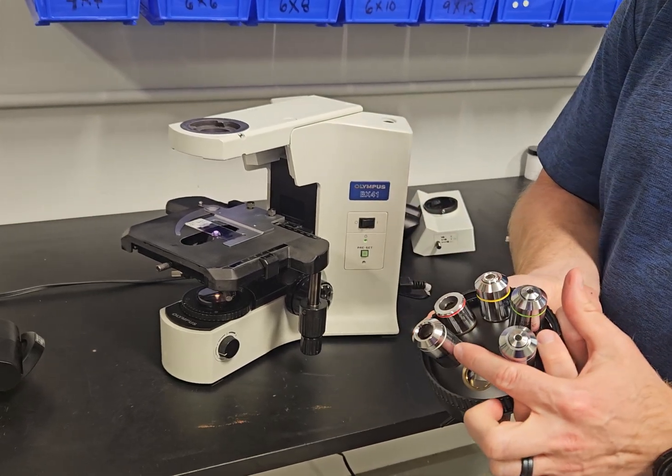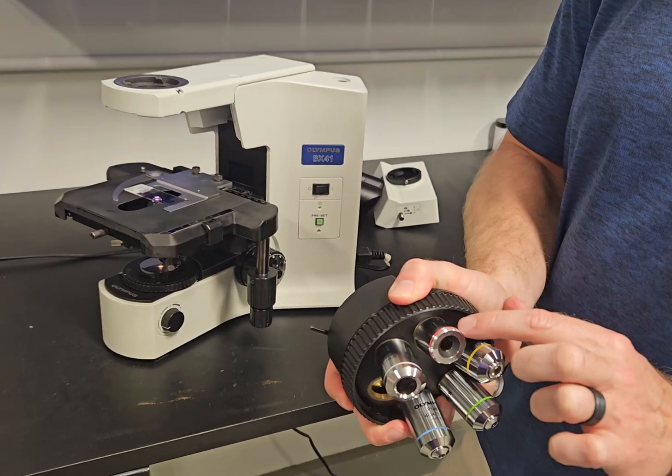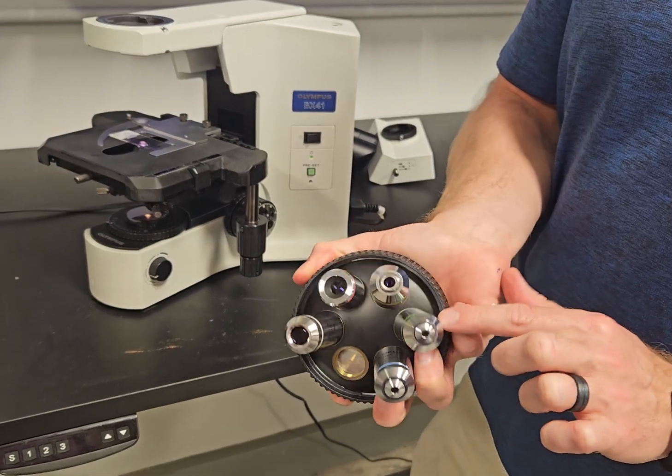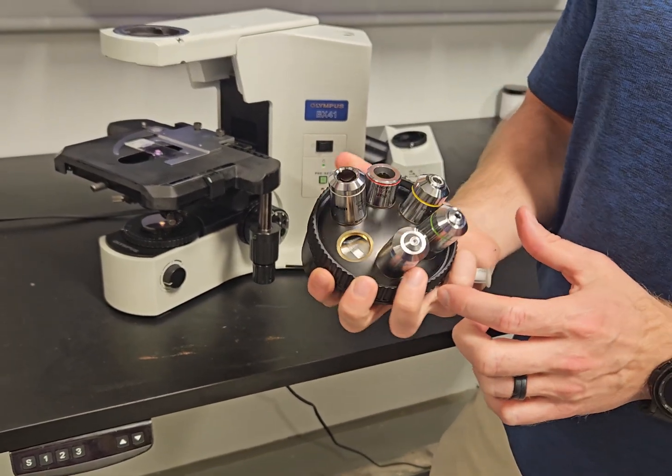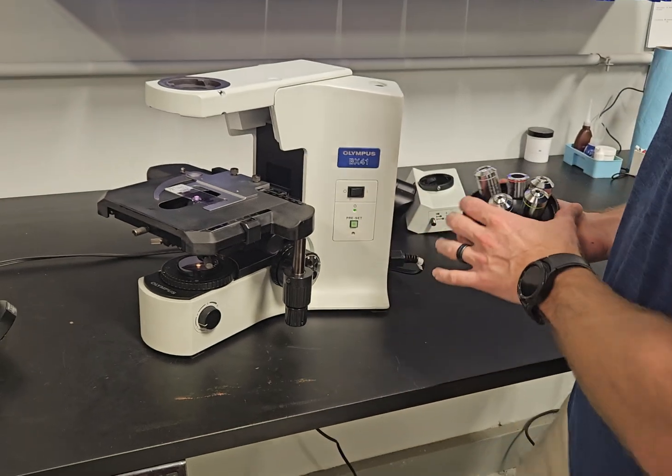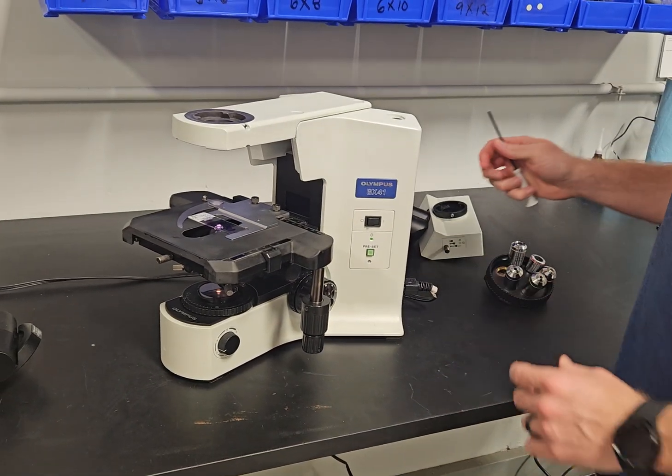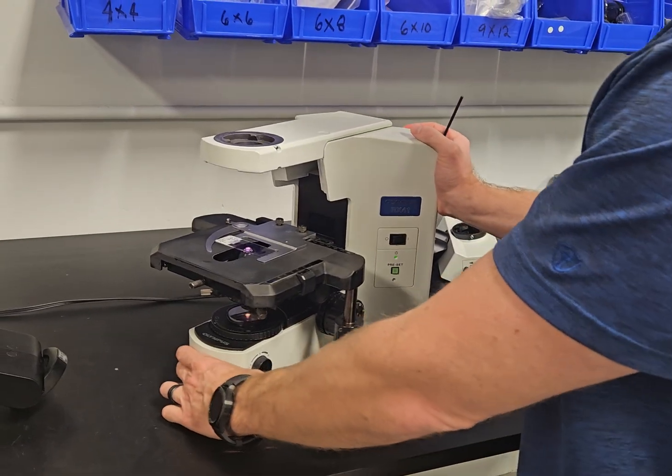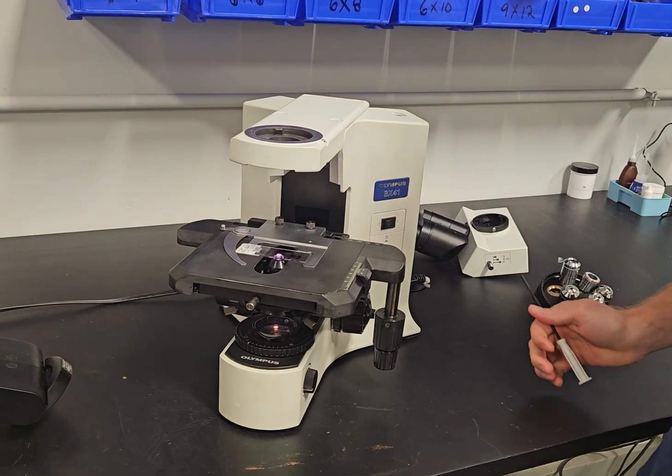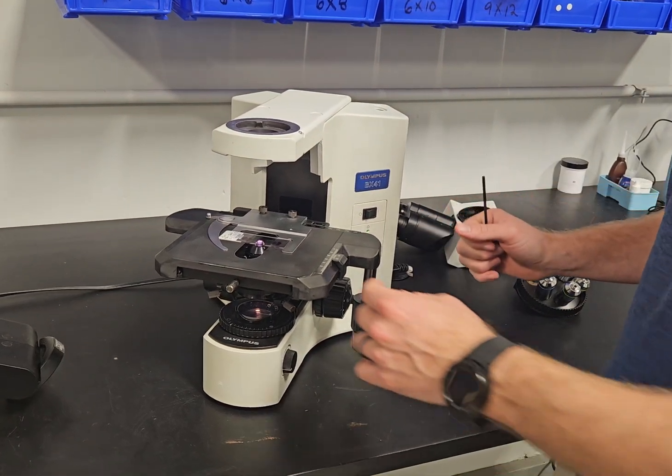The objectives, we have a 2X objective, a 4X objective, 10X, 20X, and 40X. This is going to be your most common setup for pathology. You can get a wide variety of objectives, the plans, the plan fluorites, and the plan appos.